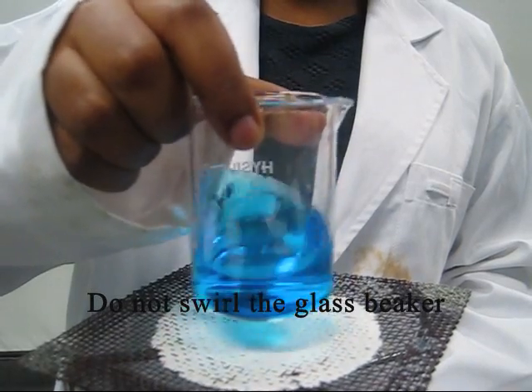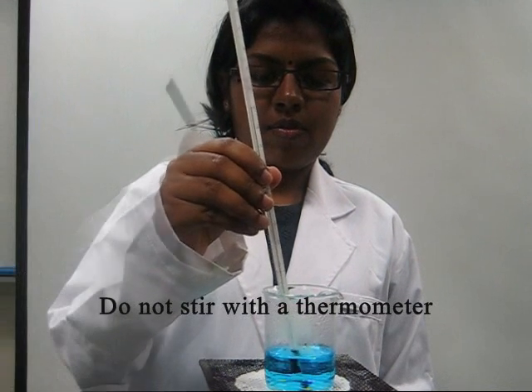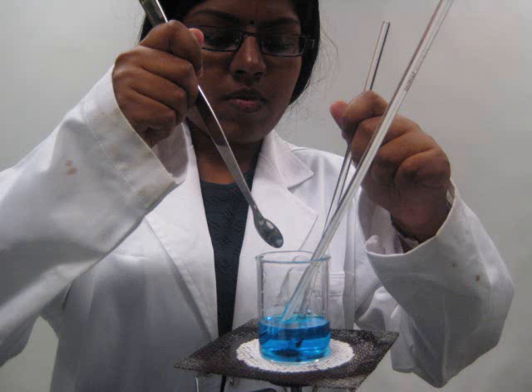You should not do the following: do not swirl the glass beaker as it may be very hot. You should not be stirring with a thermometer or a metal spatula. Avoid trying to do everything at the same time, as this may cause accidents.